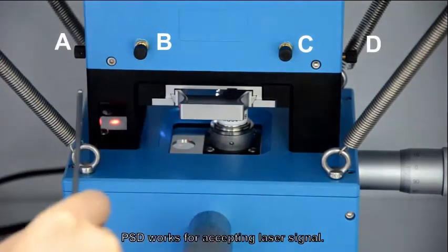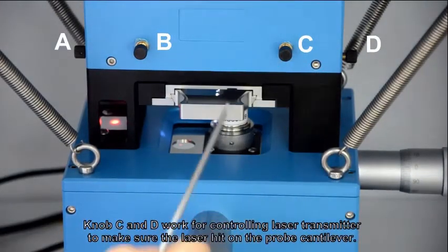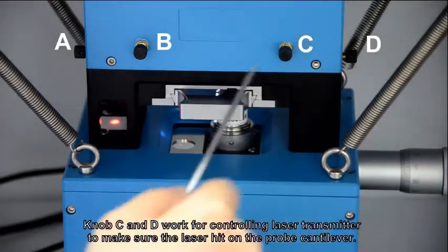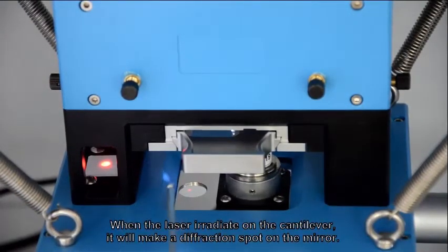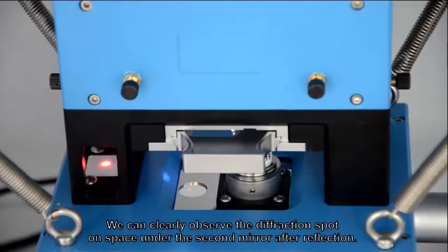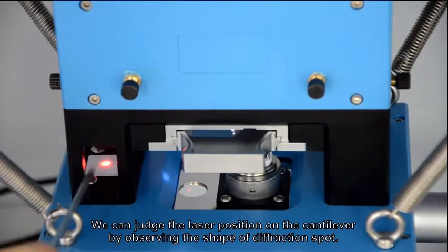Knob A and B work for controlling PSD position. PSD works for accepting laser signal. Knob C and D work for controlling the laser transmitter to make sure that the laser hits on the probe cantilever. When the laser irradiates on the cantilever, it will make a diffraction spot on the mirror. We can clearly observe the diffraction spot on the space under the second mirror after reflection.